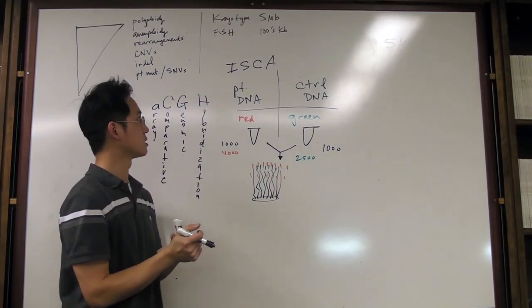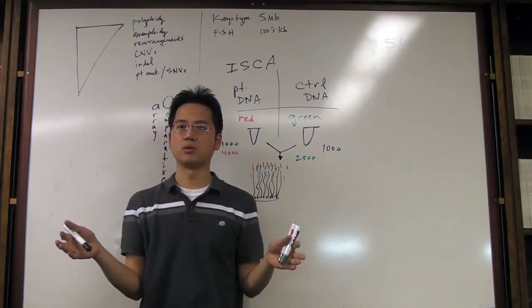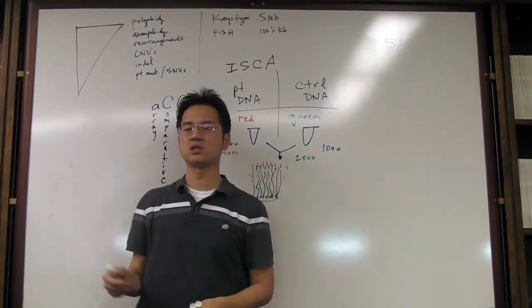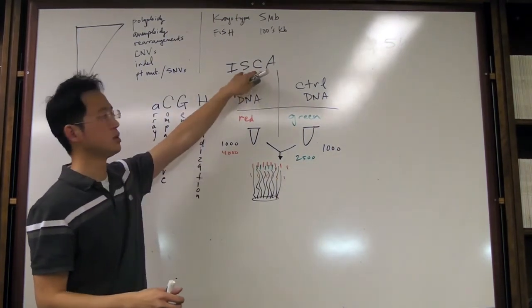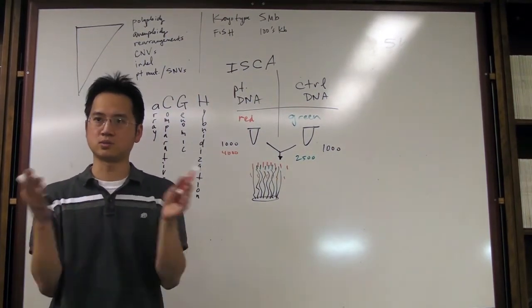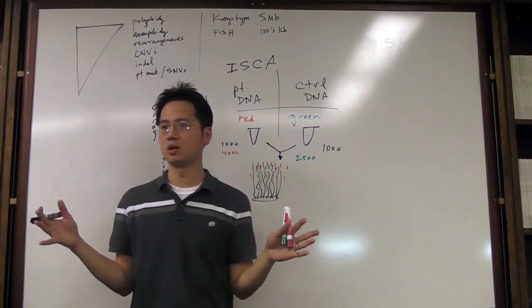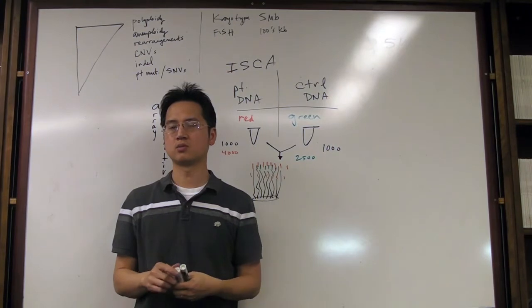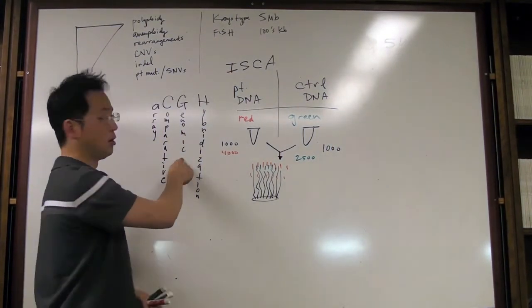for those disease sites. And then the rest of the probes are just the backbone probes, which are scattered about every 10,000 bases between each one. So obviously the disease regions will be much higher resolution because it's more packed and more dense. And the rest of the backbone will be a little bit more sparse because there's more spacing between the different probes. So that's where the genomic comes in.